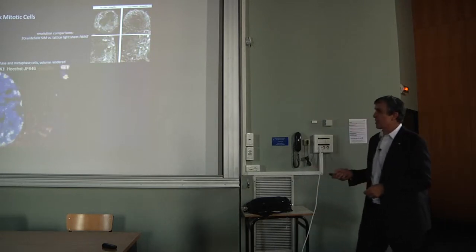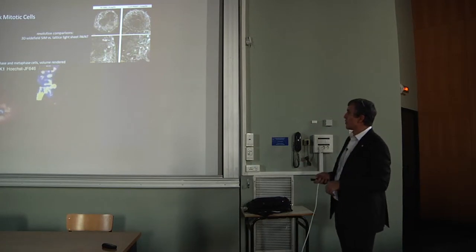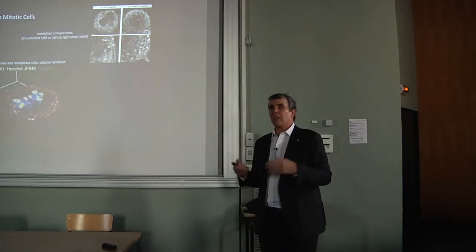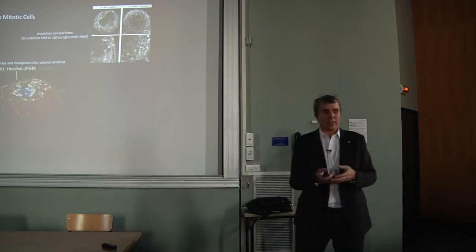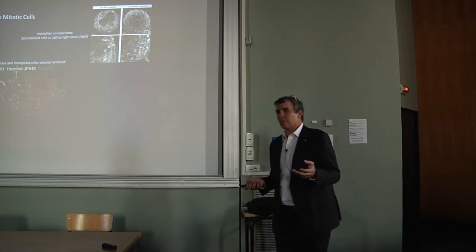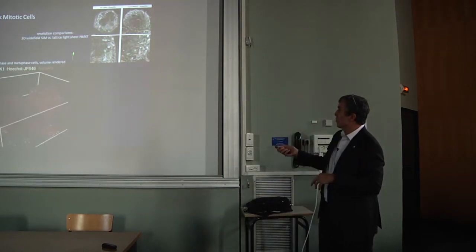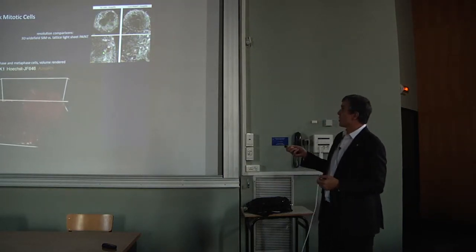So this is a different example of looking at mitotic cells, a pair of cells, one in prophase, one in metaphase. And in this case, what we're doing is comparing to another technique I'm going to talk about in a few minutes called structured illumination microscopy. So that's another method to get at least twice beyond the diffraction limit. It's often used in 3 dimensions, but it's really limited because it's a wide field technique and there's always a lot of background. And so if you go into something this thick, you get nothing but artifacts when you try to look at the sample.